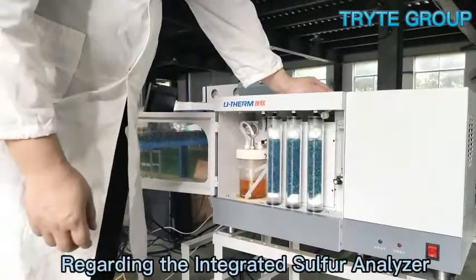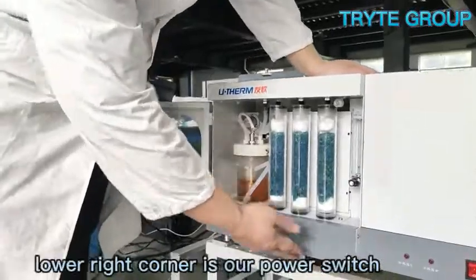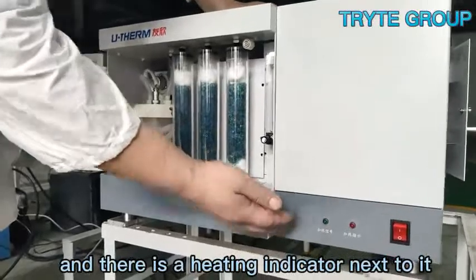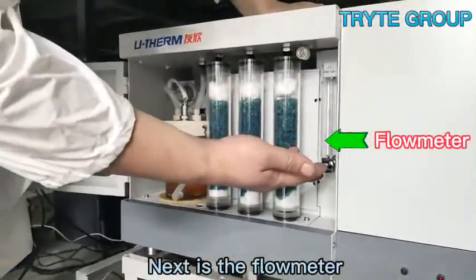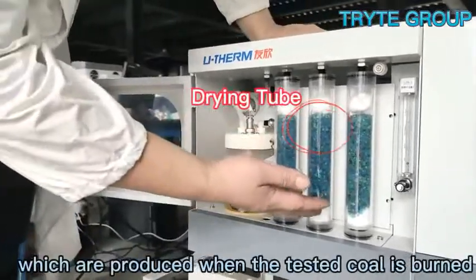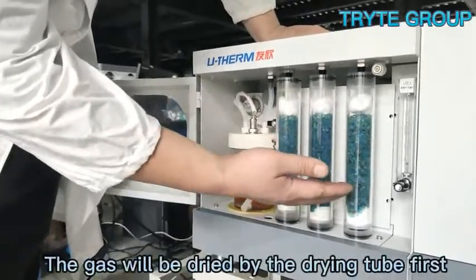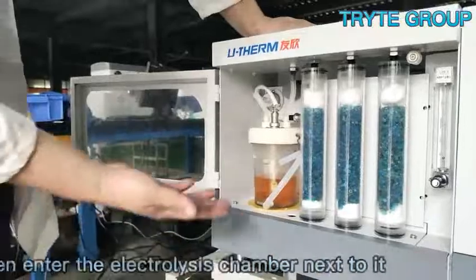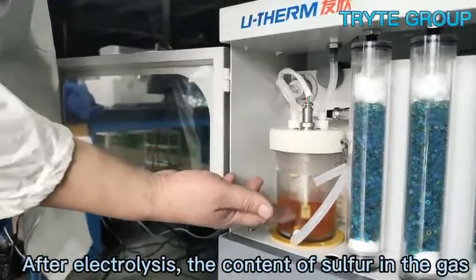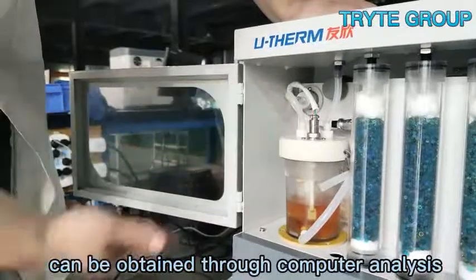Regarding the integrated sulfur analyzer, from the front, the red button in the lower right corner is the power switch, and there is a heating indicator next to it. Next is the flow meter. Next to the flow meter are three drying pipes. The gas produced when the sample is burned will be dried by the drying tube first, and then enter the electrolysis chamber next to it. After electrolysis, the sulfur content in the gas can be determined through computer analysis.